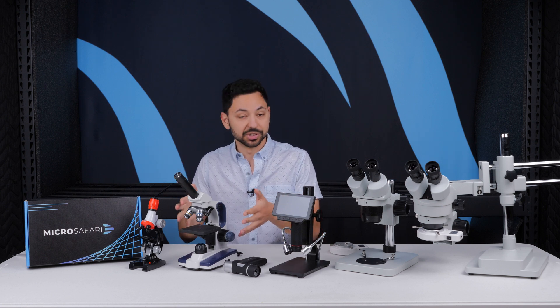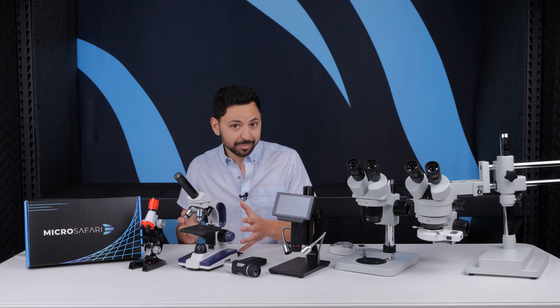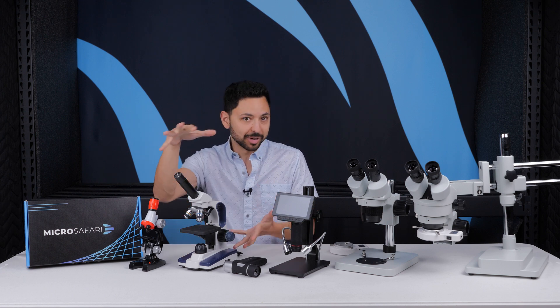If you have a teenager, they can absolutely use one of these. Or if you really want a microscope that can do a specific sample that requires a compound biological microscope—such as blood samples, cells, tissues, bacteria, that kind of stuff—you are going to fundamentally need one of these.